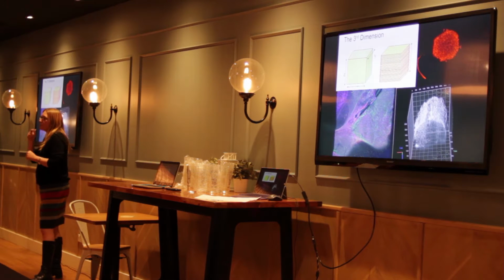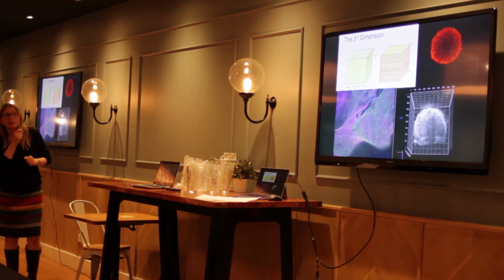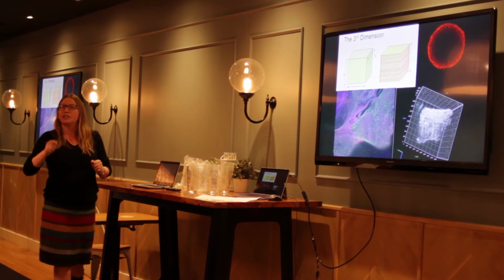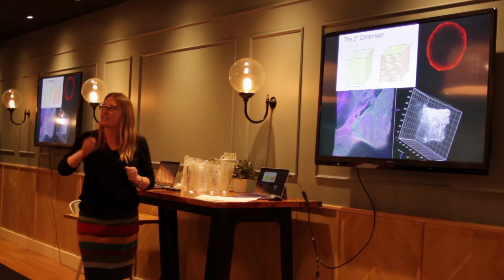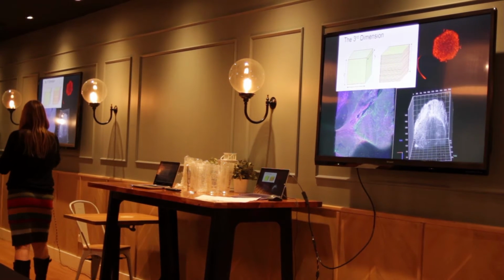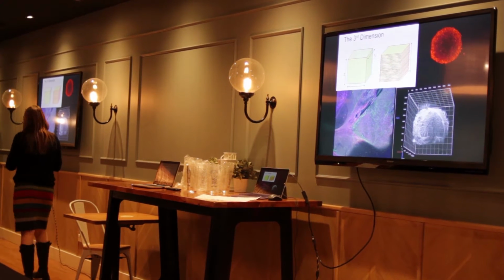What you're looking at here is a light sheet image. Okay, that's actually a spine, and it's actually had a spinal cord injury. And so then we can measure, put retrograde traces in and see them. Pretty cool.